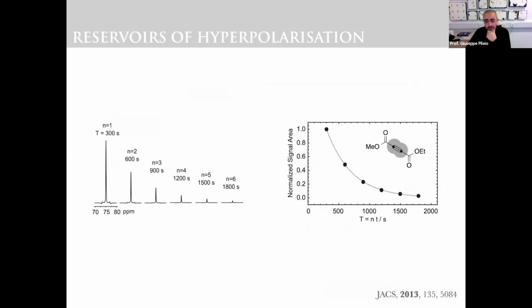Well, we did the experiment in Yarek's lab in 2013, actually. And here you see the decay of the long-lived spin order, which is alive even after half an hour, if I remember correctly. Unfortunately, I don't have the number here. The signal to noise is of the order of a few thousands after 5 minutes, and it's still 60 after half an hour.